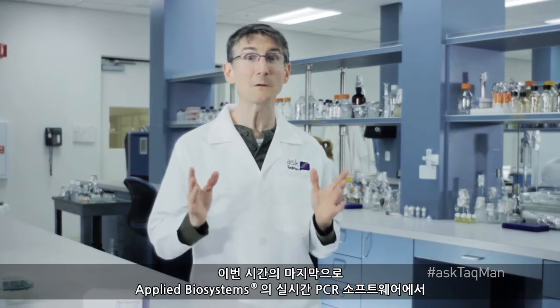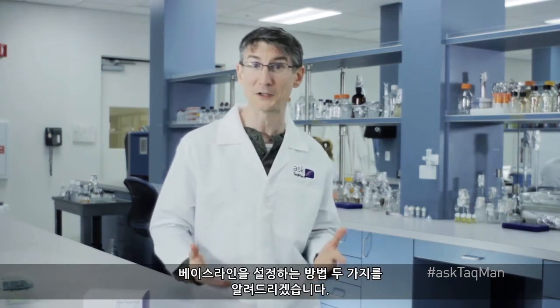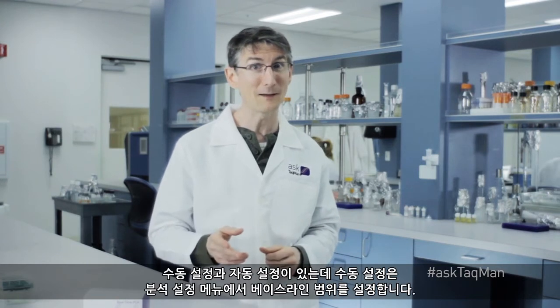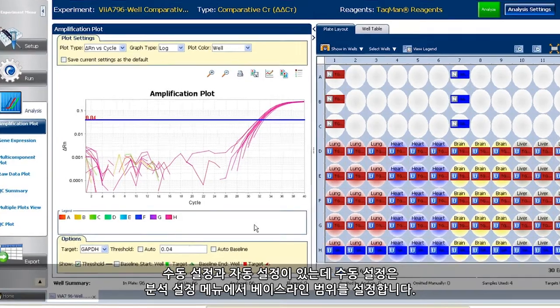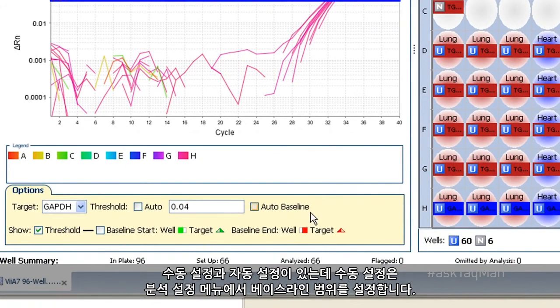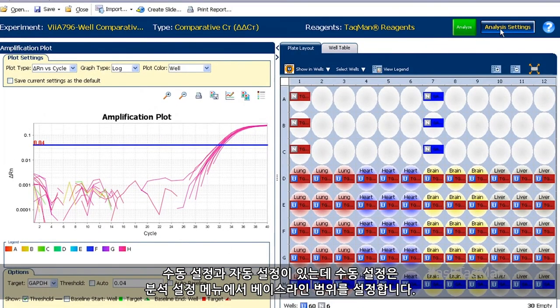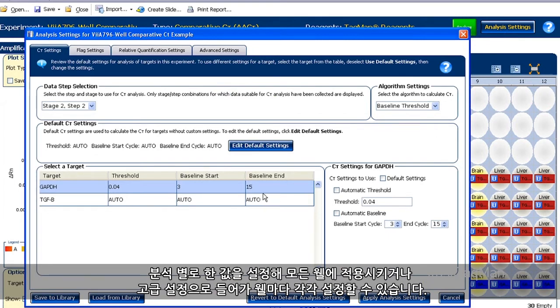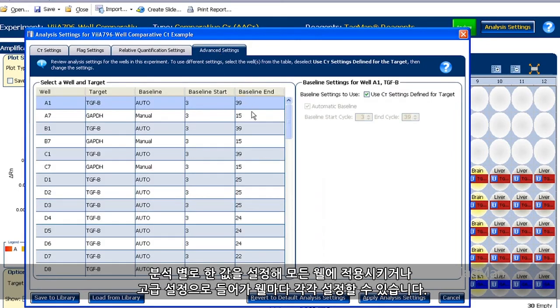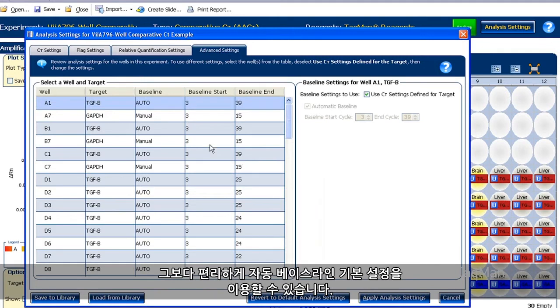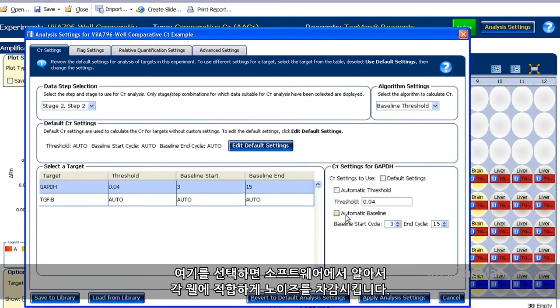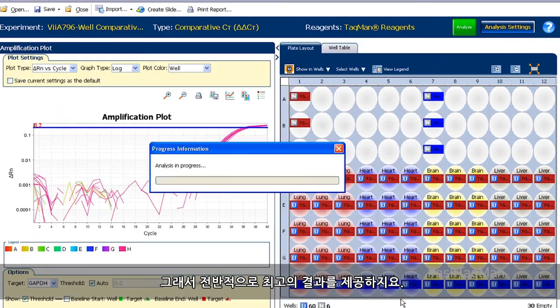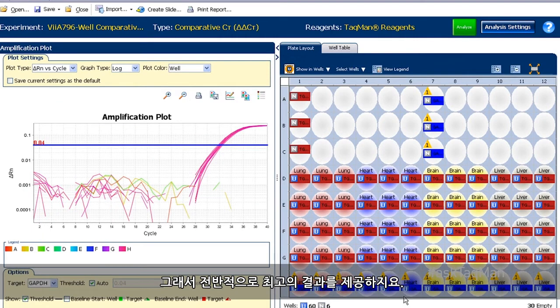But before you go, just note that there are two ways to set baselines in Applied Biosystems' real-time PCR software: manually and in automatic mode. If you do it the manual way, you set the baseline range under analysis settings — either for a single assay, in which case all wells for that assay get the same subtraction, or you can go under advanced settings and set wells individually. Better yet, just use the default setting of auto-baselining. With this selected, the software figures out how much noise needs to be subtracted from each well individually and, as such, generally produces the best results.